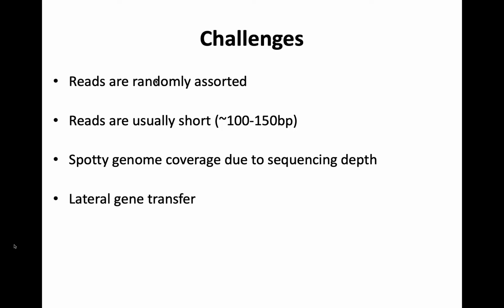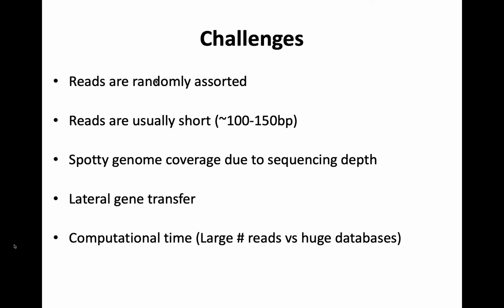Lateral gene transfer will come into play here. So if we're getting random samples of reads, we're not talking about nice universal marker genes all the time. They're hitting any spot on the genome. That could be repetitive regions. It could be genes that were recently horizontally transferred. And that means, hey, this looks like this thing, but it was horizontally transferred. We don't know that. Then it's going to give us a false signal, right? So that's problematic for sure.